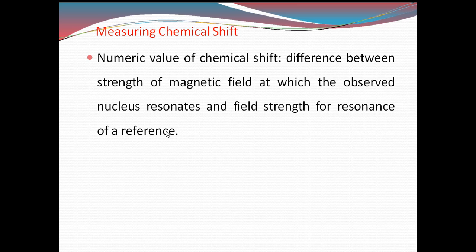In the same case, in labs also we will find out whether the molecule is correct or not. Suppose I gave some talcum powder and asked you to find out whether it is paracetamol or not. Then what will you do? You have to take the IR spectrum of an original paracetamol substance, isn't it? So the original standard paracetamol IR spectrum should be taken, and you have to take the IR spectrum of the powder that I gave to you.